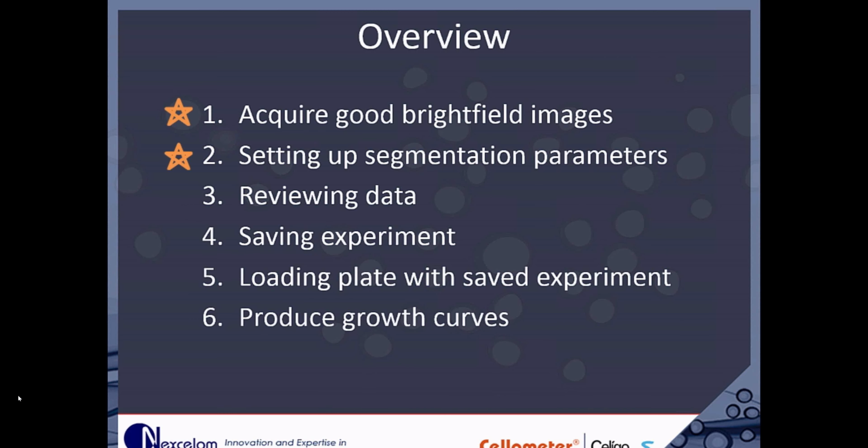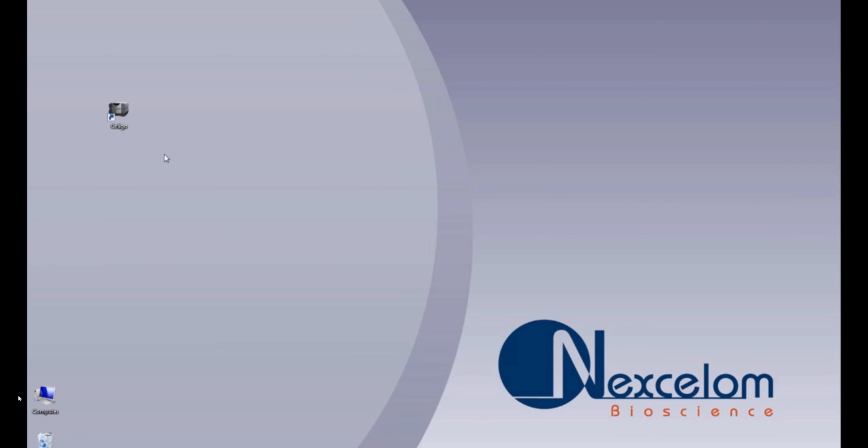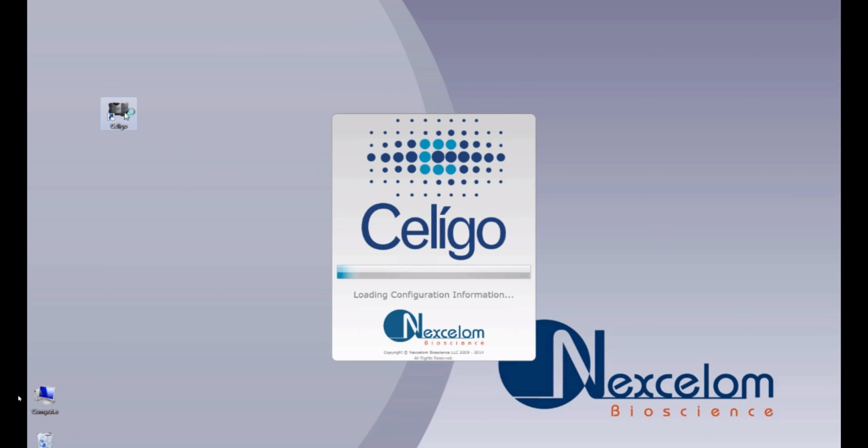But mostly I really want to focus some extra detail on the first 2 points, how to acquire bright field images and set up segmentation parameters. So let's get started. So on your screen, you're going to select the icon Celigo to start the software.